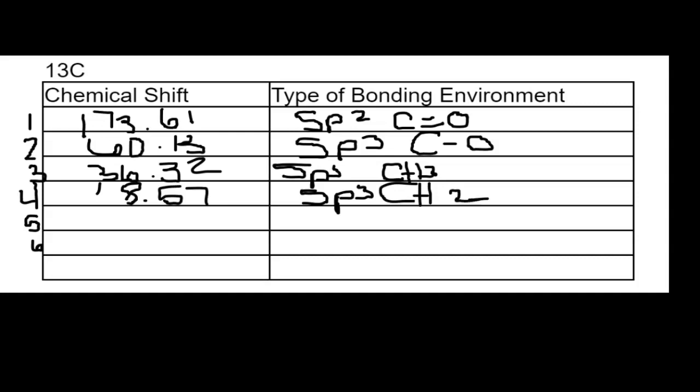Number 5, 14.32. That will also be sp3, CH2.